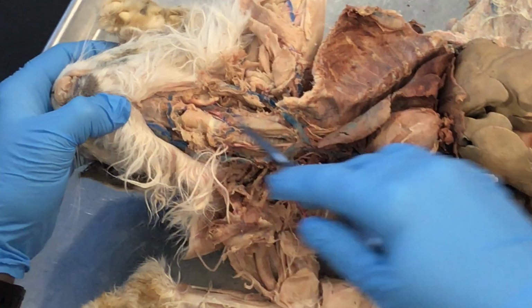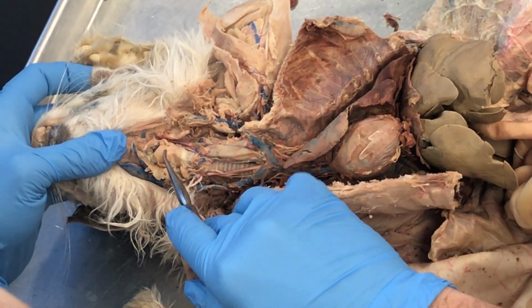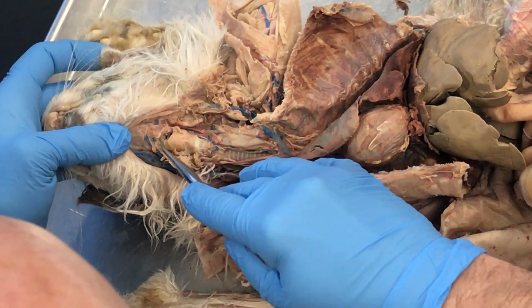Larynx. So larynx is where vocal production occurs. It's going to be this area right here. This is actually thyroid cartilage, so this entire area right there is the larynx. So vocal production occurs here.